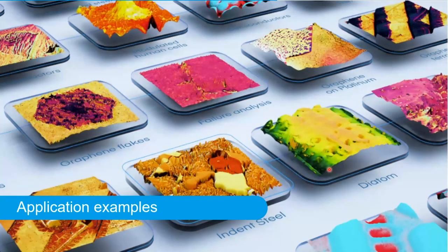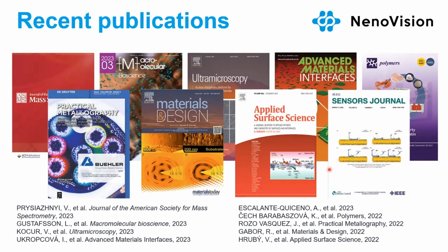Let me share a few application examples with you to motivate and inspire you about what can be done with the AFM inside the SEM. I'm very glad that recently many publications have appeared using the LiteScope. Later on, you can check that within half a year there are many of them. So I chose some of them, and I would like to share the story of the applications.